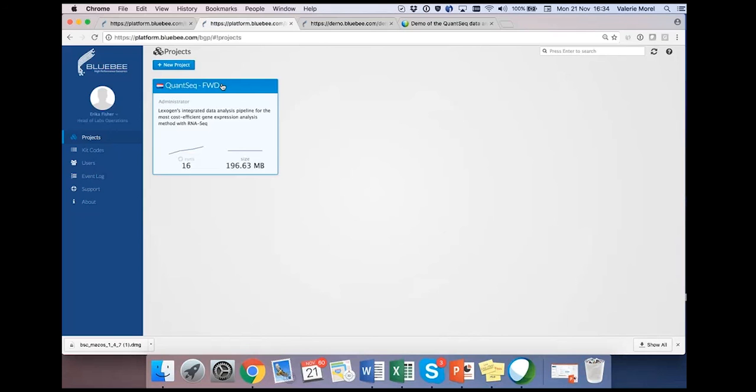And of course, you can use other software like Trimmomatic, TrimGalore, even the old FASTX toolkit trimmers can work with it. But in terms of speed, BBDuk from the BBMap suite is most suitable here. And the quality parameter for HTSeq count, as far as I remember, we used a minimum mapping quality of 10.